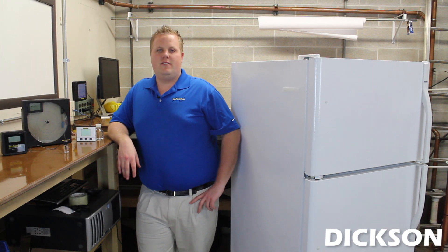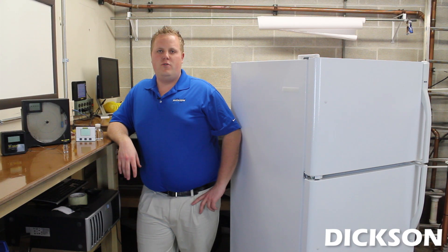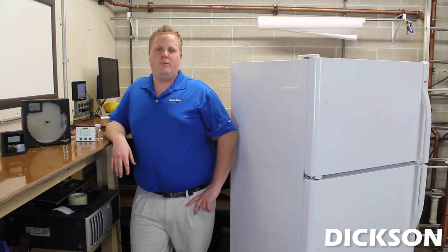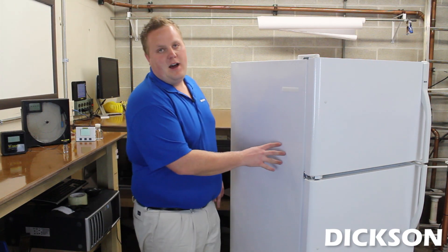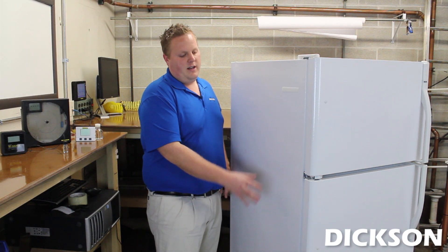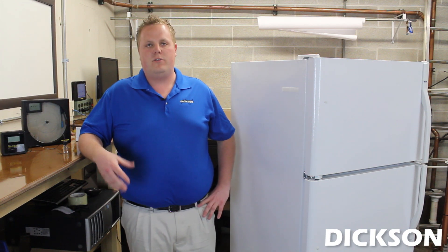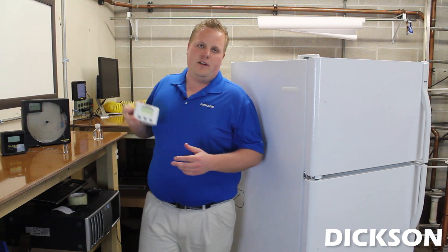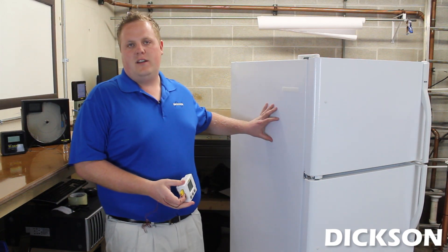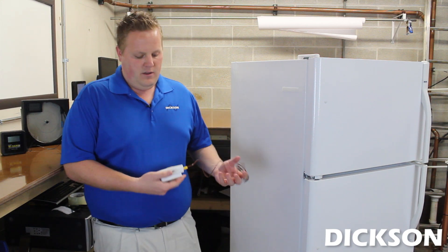Hi, my name is Jim Gibson. I'm with the Dickson Data Company. We're back here in our demonstration area today and I'm going to show you a few ways to run our K-type thermocouple probes into freezers and refrigerators. Our demonstration today will take place on a household freezer refrigerator, which a lot of labs use, but you can also use this technique on walk-in freezers and walk-in coolers as well. The reason you'd want to use a probe model is if the temperatures are way too cold for electronics, or if you're using our wireless product and you'd like that wireless signal to get out.